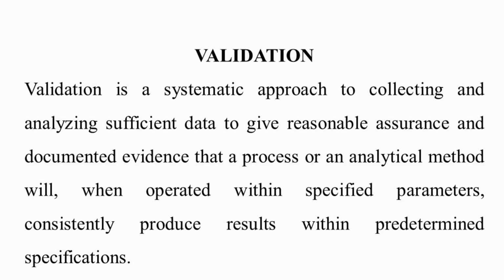Let's try to understand the validation terminology. Validation is a systematic approach to collecting and analyzing sufficient data to give reasonable assurance and documented evidence that a process or an analytical method will, when operated within specified parameters, consistently produce results within predetermined specifications.